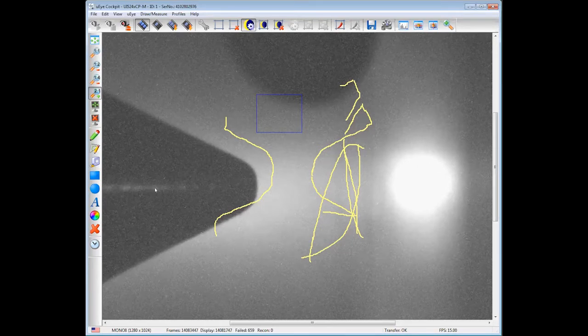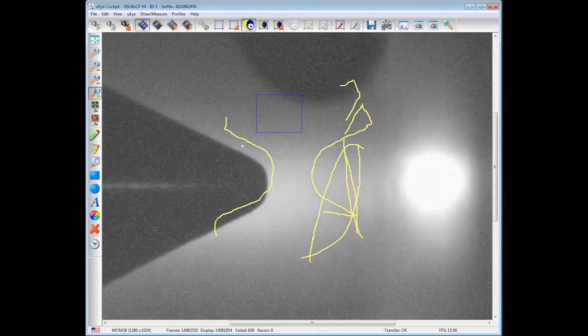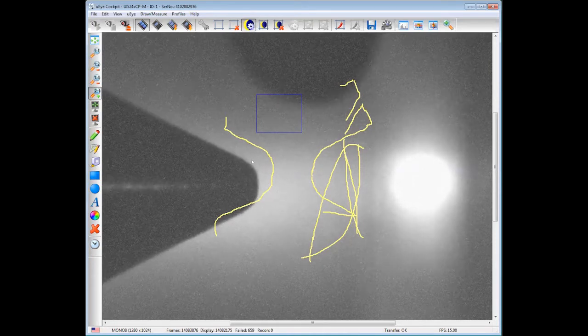So Brett is now manipulating the cell. You see that the nozzle, which is actually part of the cell, is moving a bit when you press the cell, when you release the pressure a bit, and so on. Now, after we have connected the cell, we can insert the sample into the cell, close the door, and then approach the nozzle with the sample. This nozzle is actually the aperture which collects electrons.